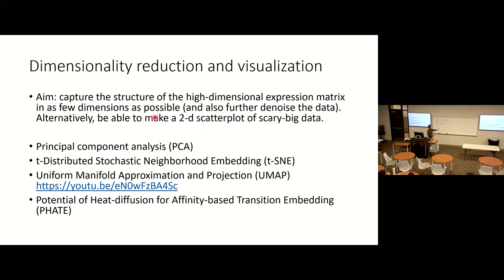PCA is only to rotate your data cloud. Rotate, okay. It allows you, using low dimension, to see more variability among data points. If you rotate the data, you still keep the original dimension. You don't have to reduce it. Your data is still the same, okay? So PCA is not a technique to reduce dimension, but to find a rotation matrix.